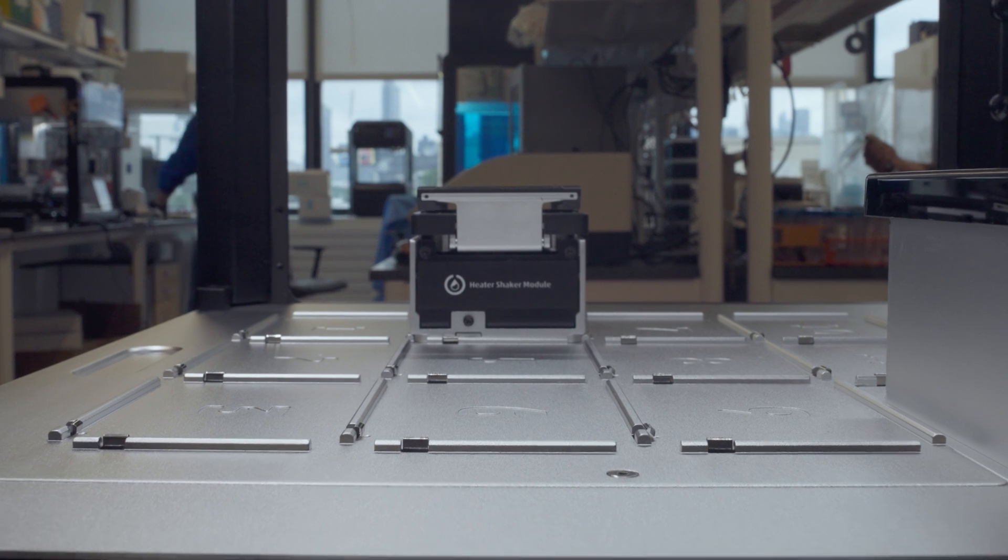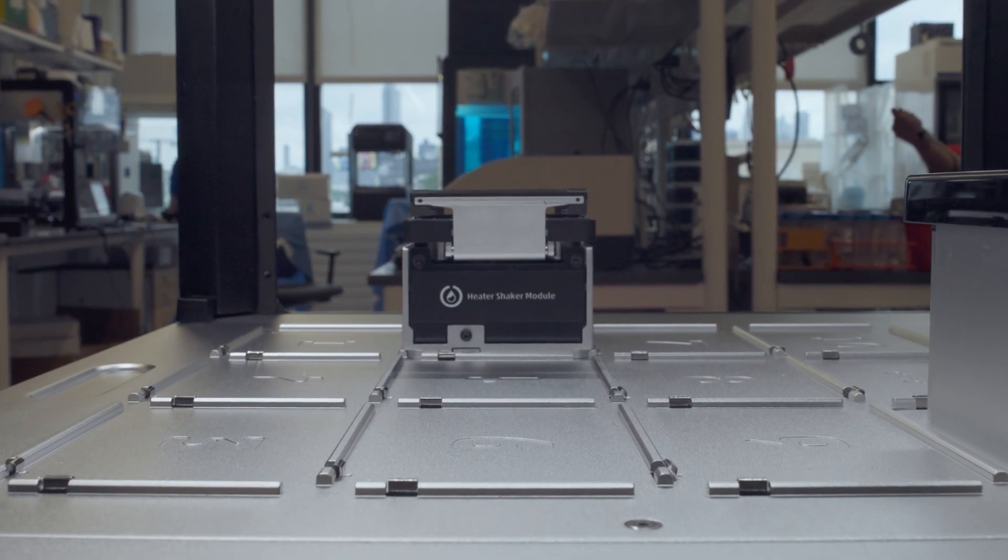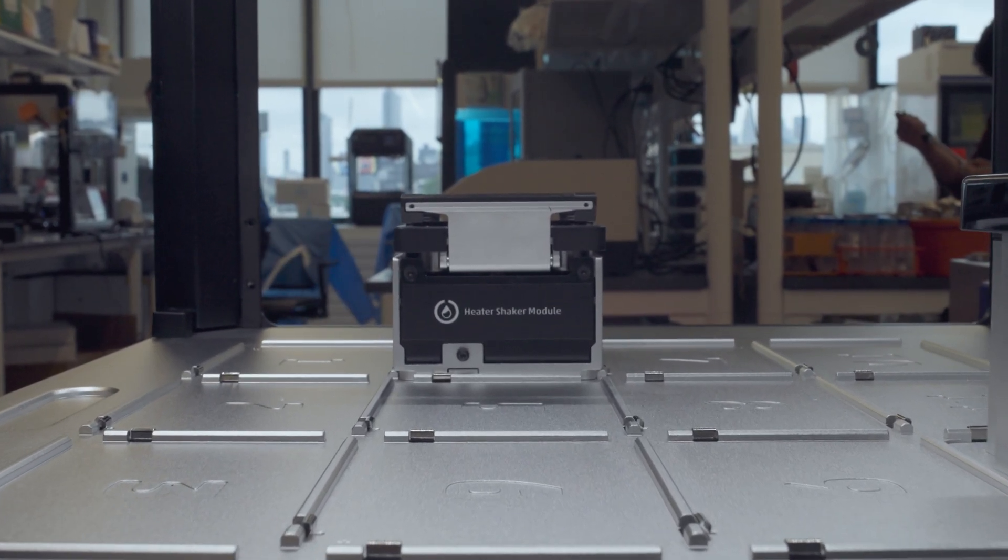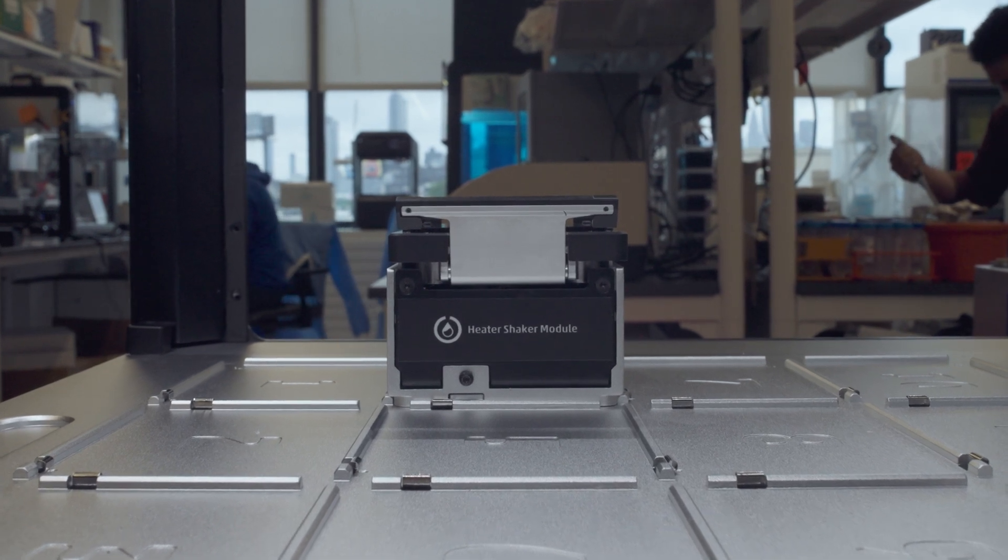This is the Opentron's Heater Shaker module. You can use it to automate heating and orbital shaking of samples on your Opentron's liquid handling robot.